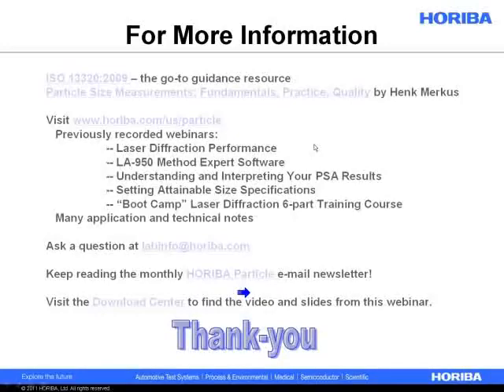Hong Sun asks a question. If you measure a mixture that has two parts blended together, can you see two separate particle size distributions? Yes, it gets back to the resolution that I was talking about earlier. If they're sufficiently different in size, you should be able to resolve both distributions.